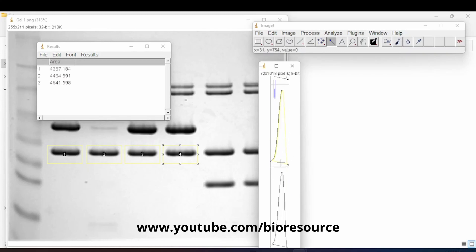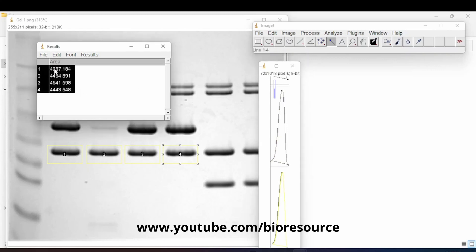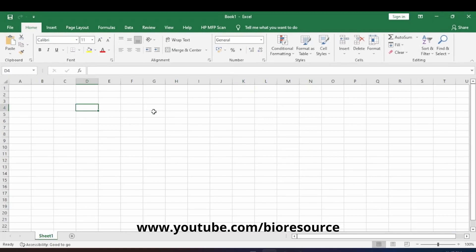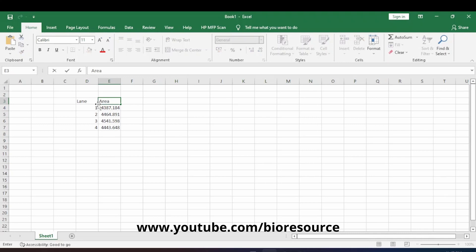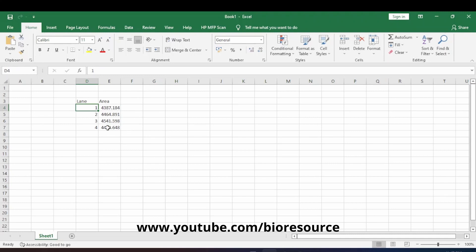You will get the area for the second, third, and fourth peaks as well. You can then copy this data and paste it into Excel. Now we have the lane details and the area of each band organized in the spreadsheet.